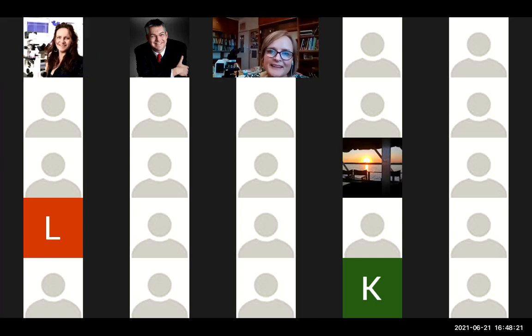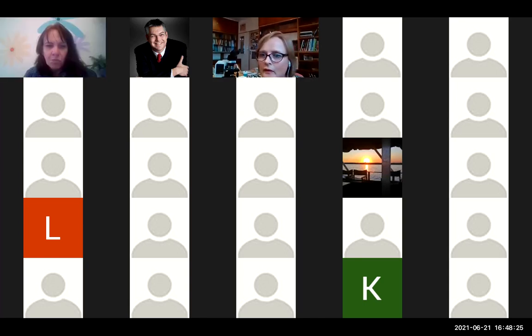Jessica, sorry, just before you go on, I see there is one question in the chat box. Oh, sorry, I've just seen that now. Okay, Karen, I'm not sure if you can see the question. It says, are the BCR-ABL qPCR tests the same from lab to lab, especially the P210 assay? That's pretty much the only one.